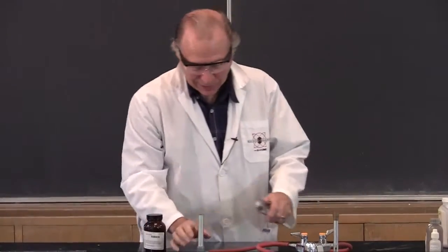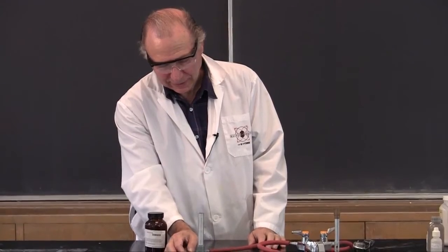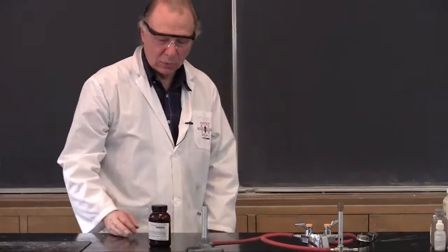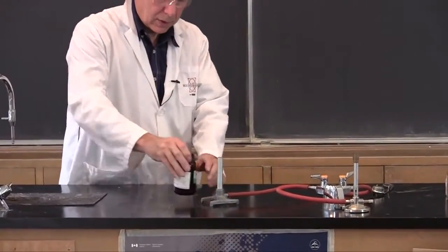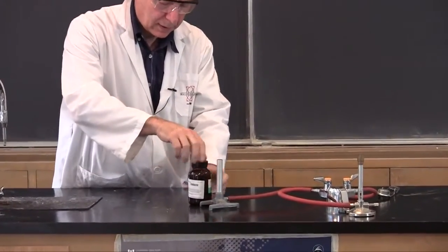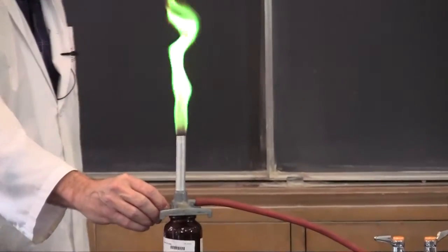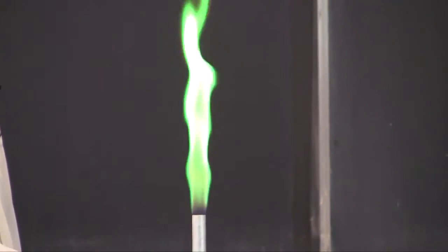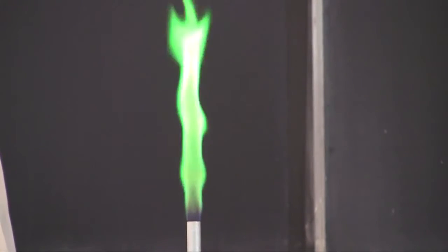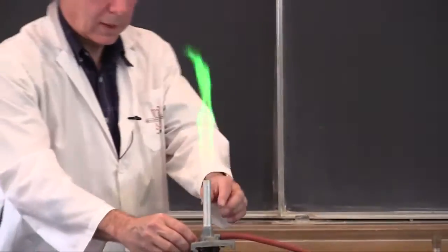Got to turn the right one on here. All right, so there's our blue flame. Shake her up. That should be a nice emerald green color. Okay.